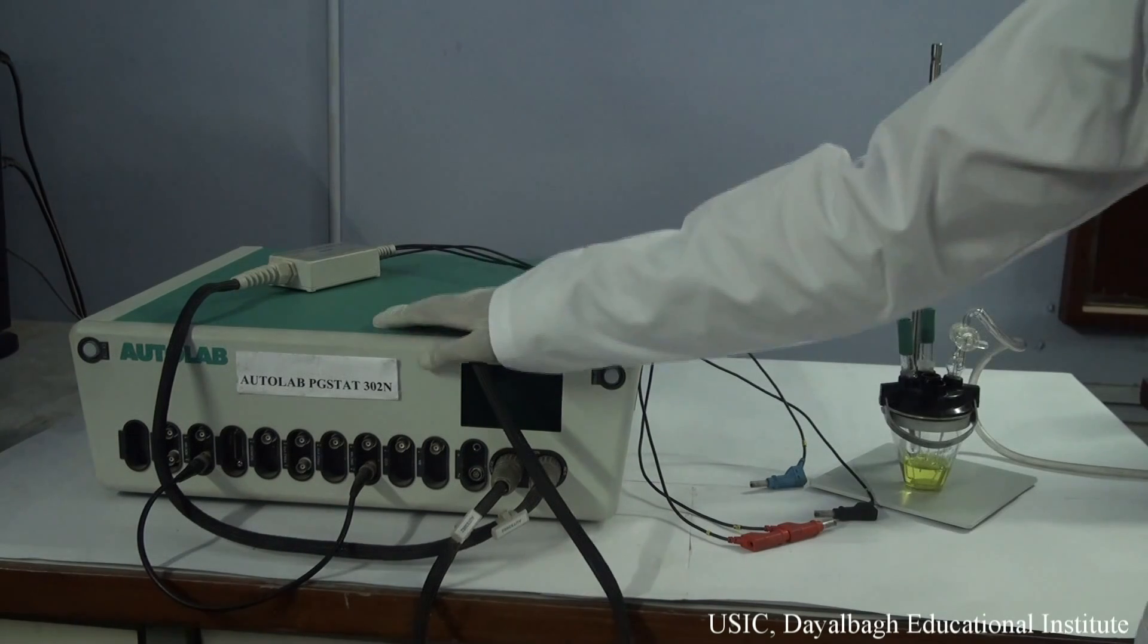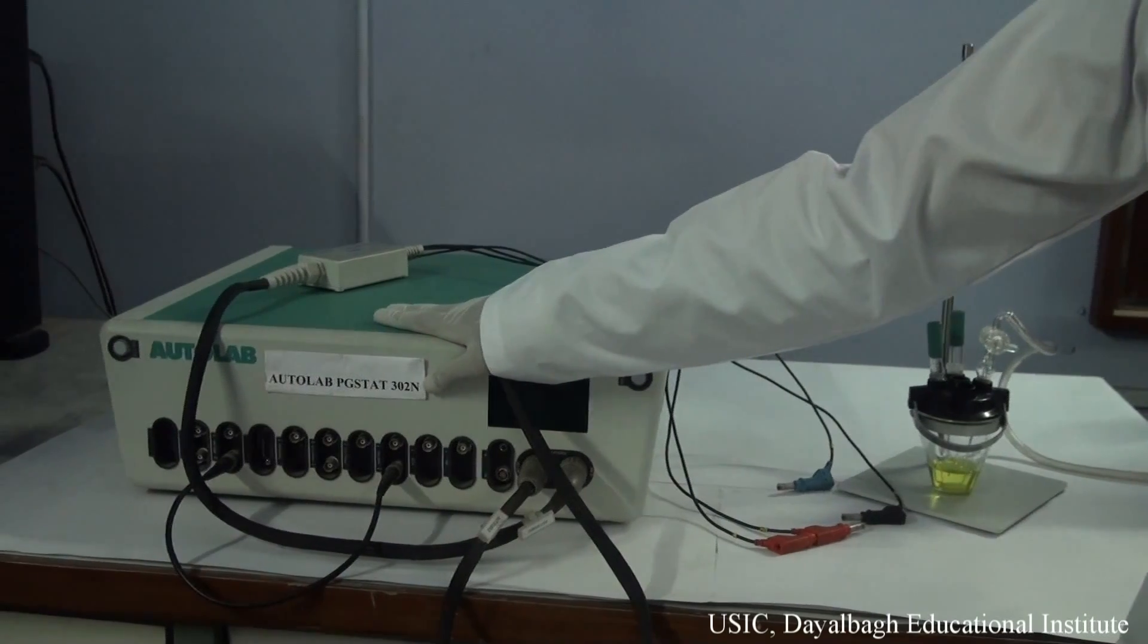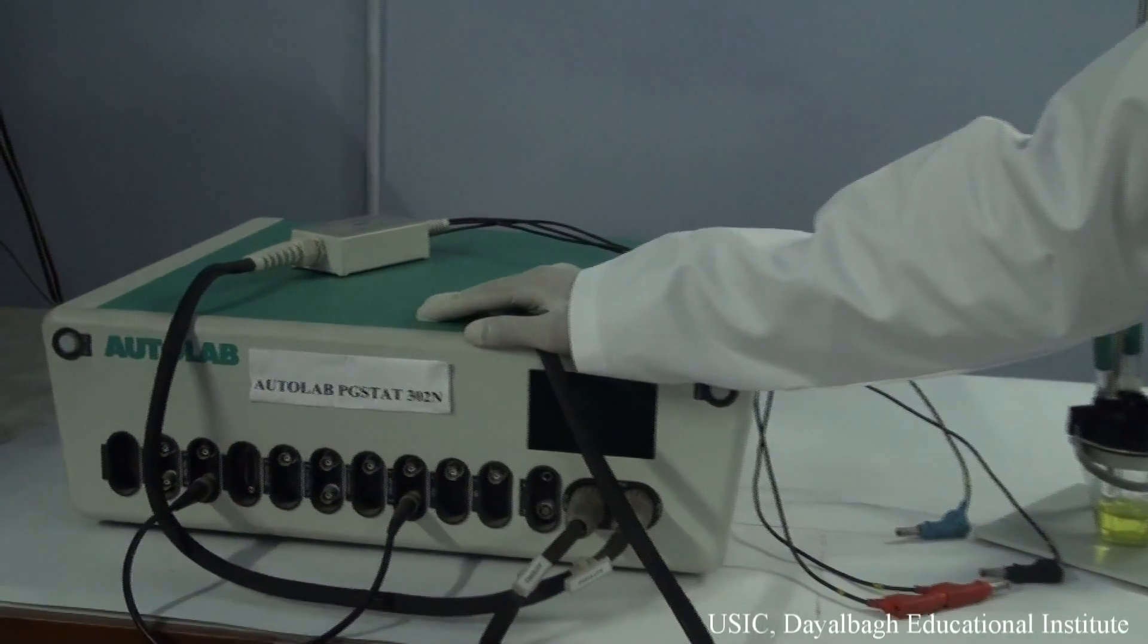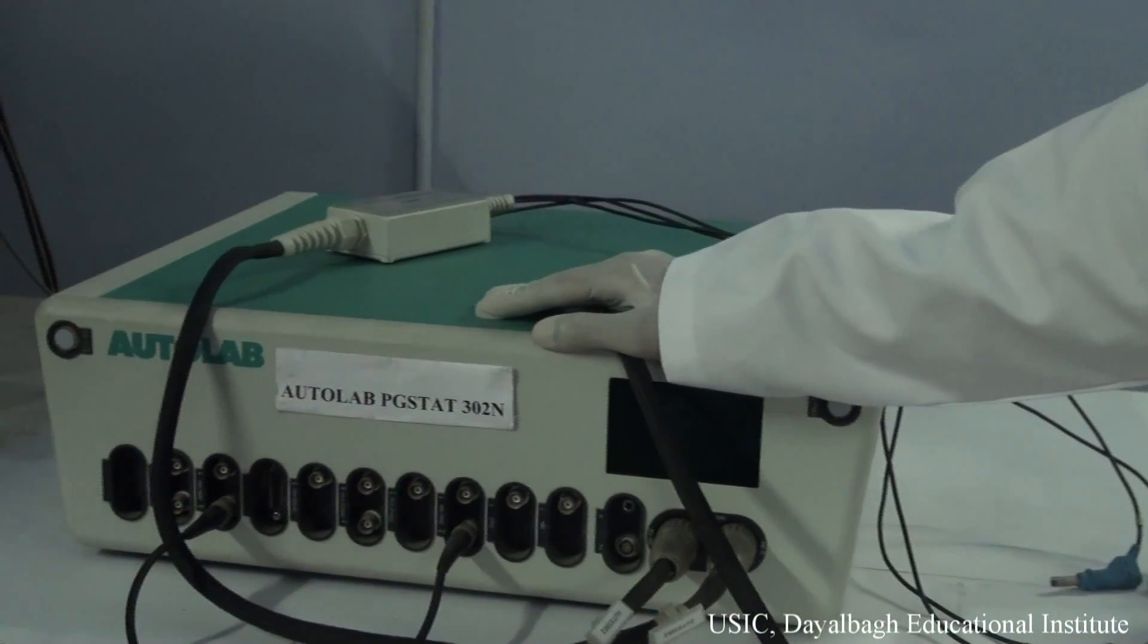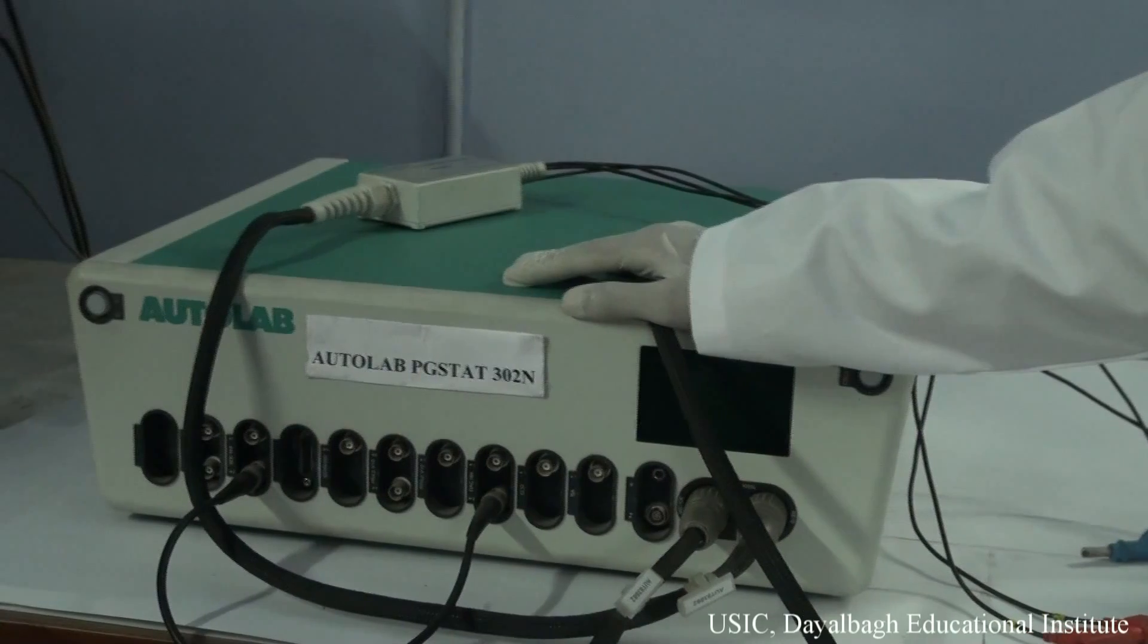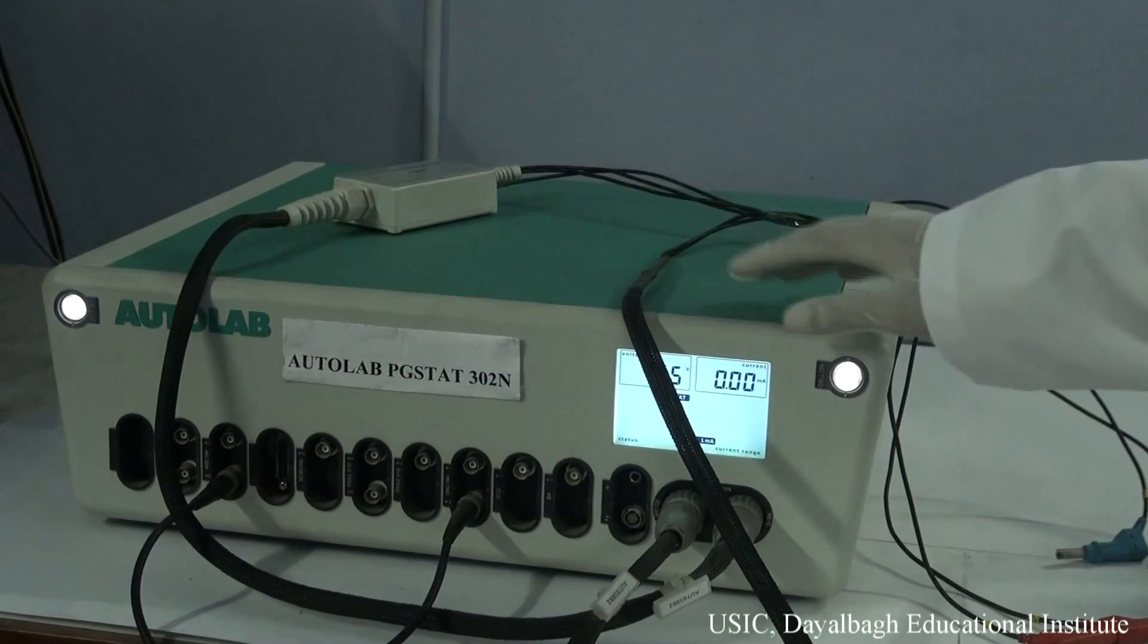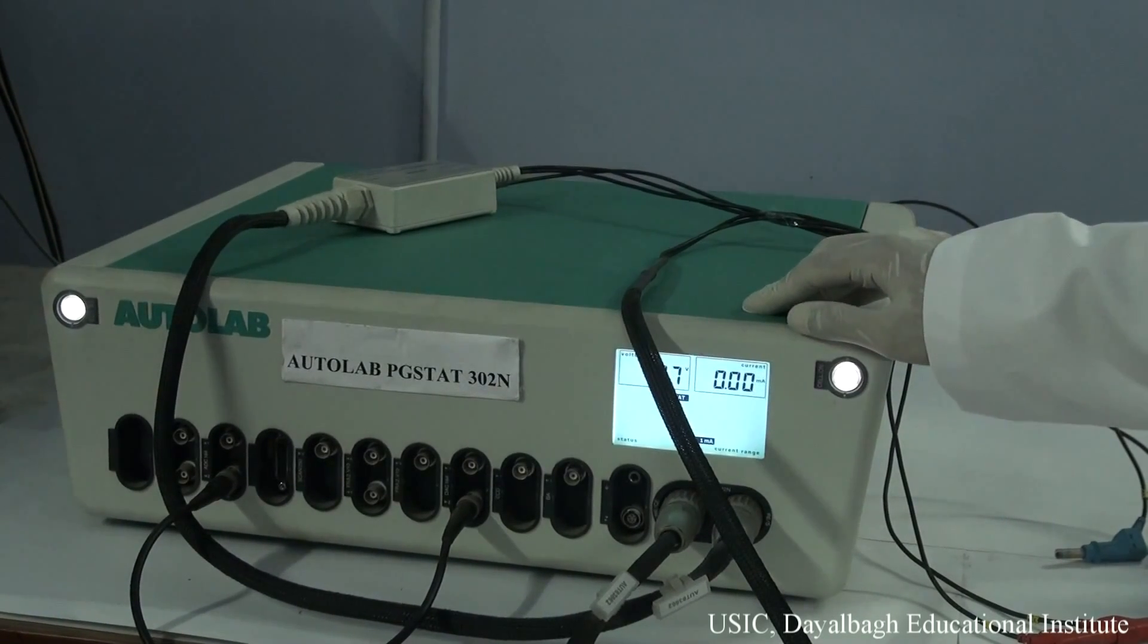Now this is the potential stat, Autolab PG-Stat 302N. It has sensitivity up to 10 to the power of -12 amperes. It can read up to picoamperes. Now we switch on the main of the Autolab.